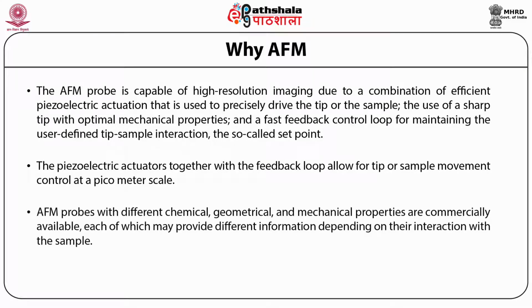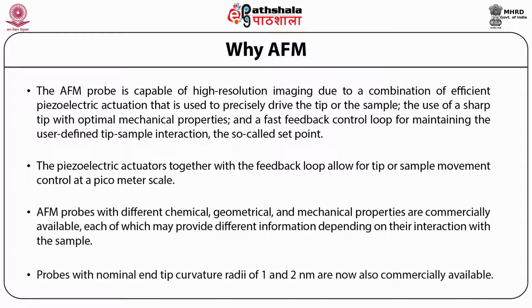AFM probes with different chemical, geometrical, and mechanical properties are commercially available, each of which may provide different information depending on their interaction with the sample. Probes with nominal tip curvature radii of 1 and 2 nanometers are now also commercially available.